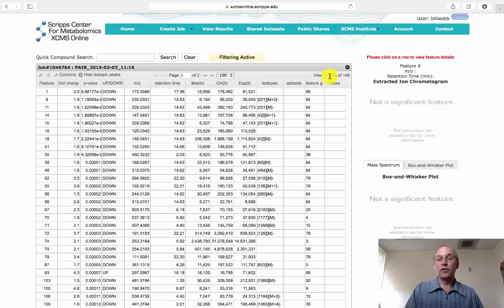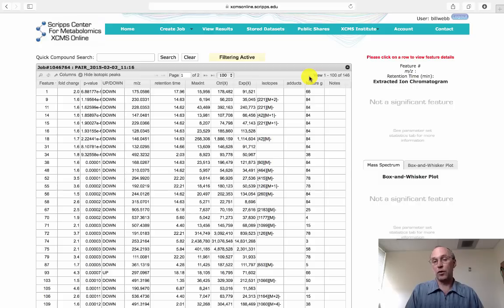And we notice that our spreadsheet of 19,000 lines is now a spreadsheet of 146 lines, which is much more manageable.